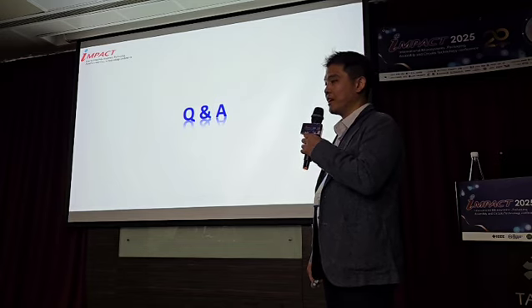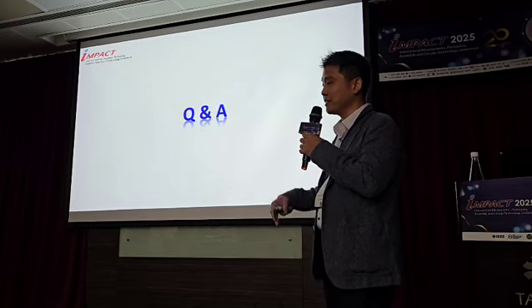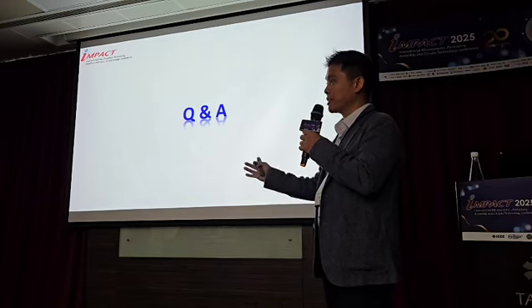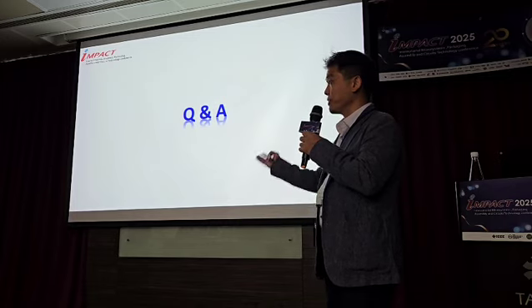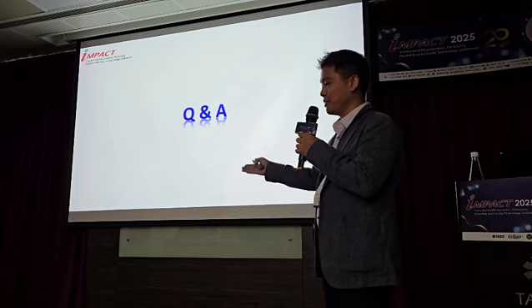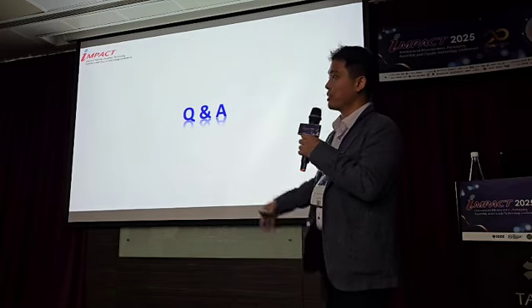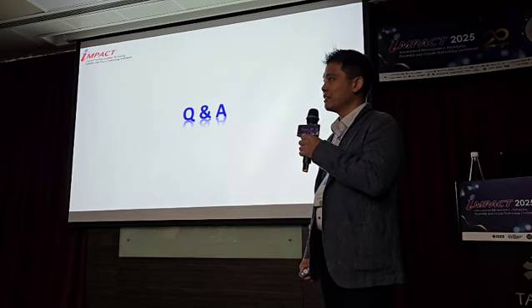If you are looking at, let's say, a packaged microelectronic after the fact, then certainly the cross-section would be better. But once we backtrack to what the source of the contamination is, let's say what you see on the surface of the metals or the gold pad, then we can do a top-down. That's okay in that case. So it's pretty flexible.